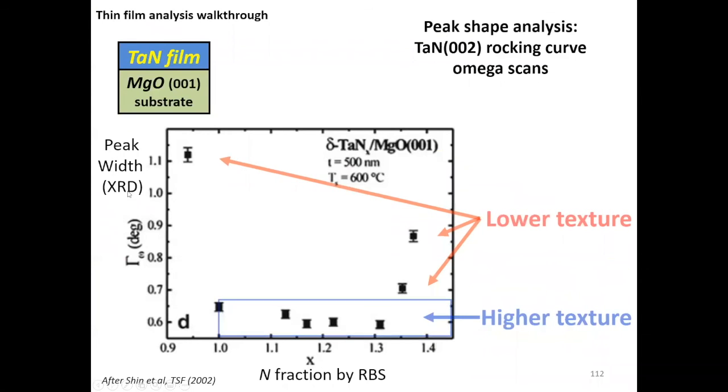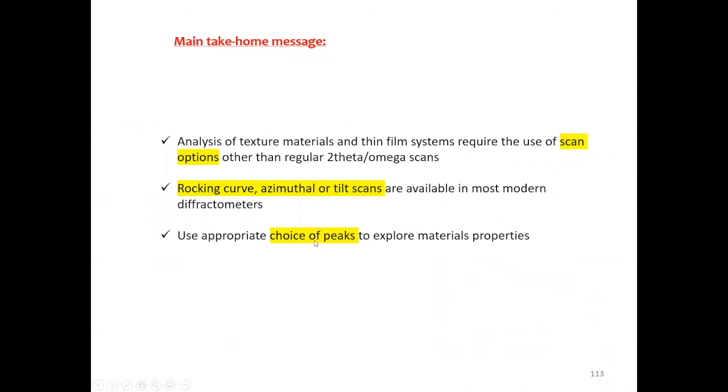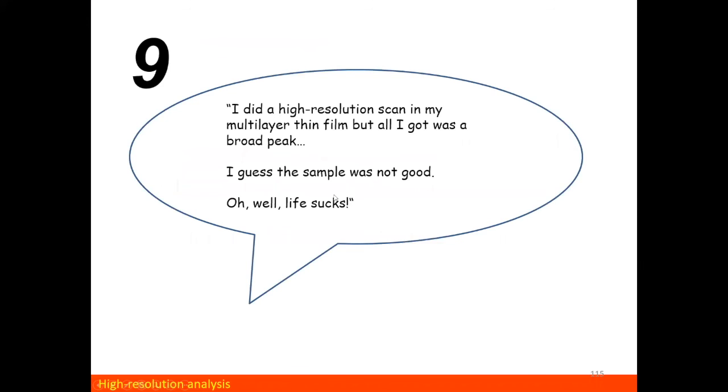In this particular case, we have a researcher that was working on an epitaxial material, he believes, a very close-match material that does deserve high resolution. And basically, this is the structure, the substrate. We have a relaxed film, and this silicon top fits that strain. This structure goes directly in your Pentium processor nowadays.